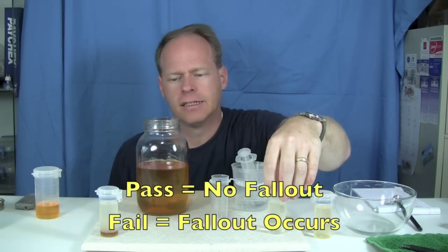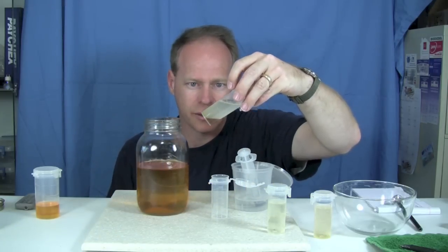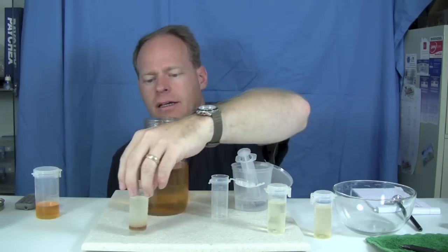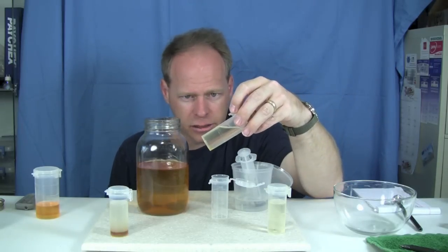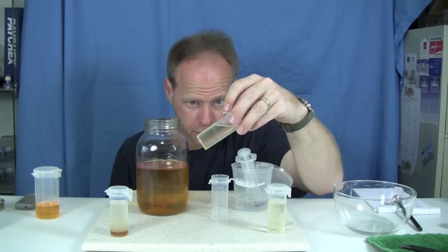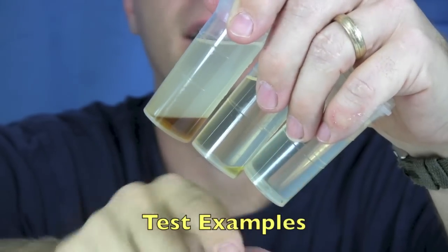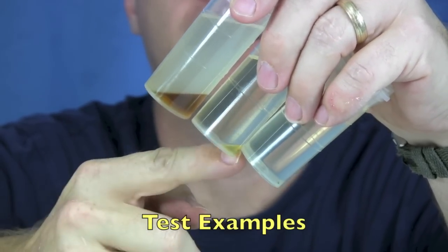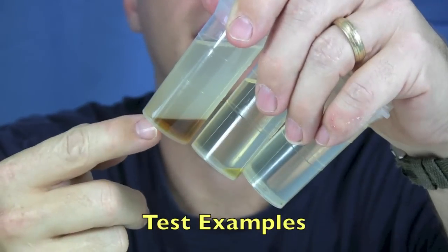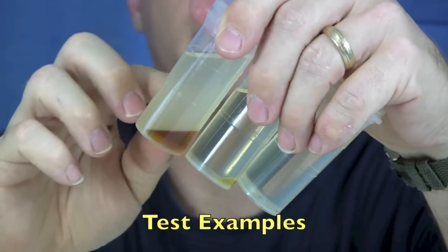There's no fallout in this batch at all. This is an example of taking just plain oil and putting it in — you can see we have all three milliliters settling out. Then we have an example here of a batch that didn't quite react all the way, and there's some puddling down on the bottom as well. This is an example of a completely passed test — notice there's no fallout. This test has some fallout in the corner, and this is just plain simple oil in this batch — notice how cloudy it is as well.